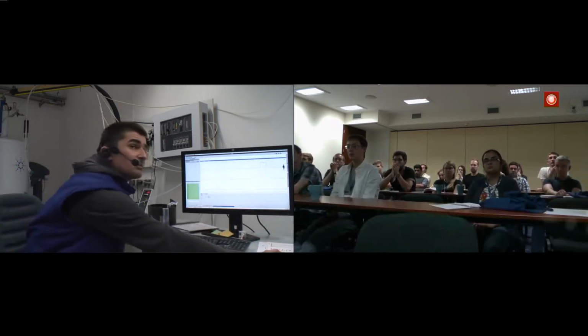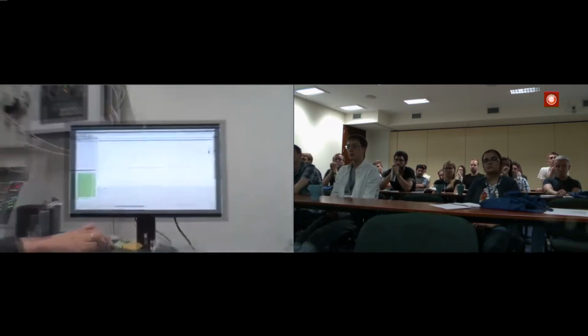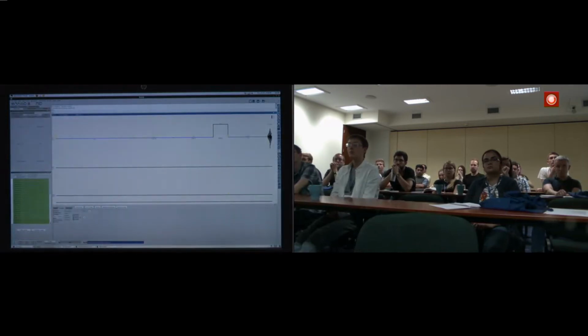All right, so a very simple experiment. I would like to magnify the display now. So this is our carbon-13 channel. We would like to irradiate it simply with a 90-degree radio frequency pulse. We would like to excite the system, and then listen to what the system is going to tell us. So we would like to acquire the FID, and then after Fourier transformation, we will observe a certain spectrum.